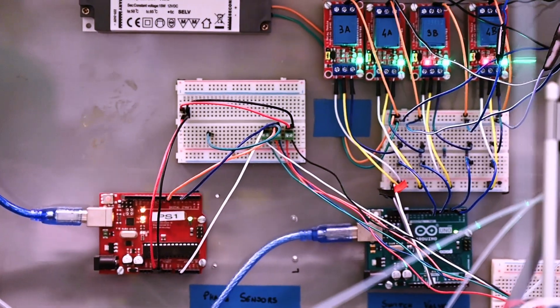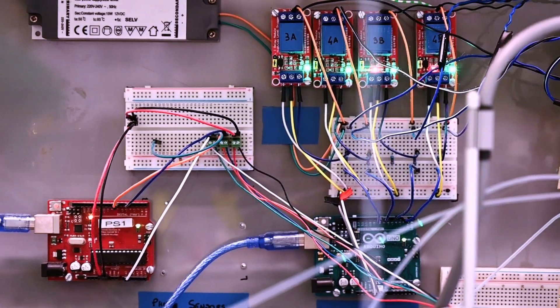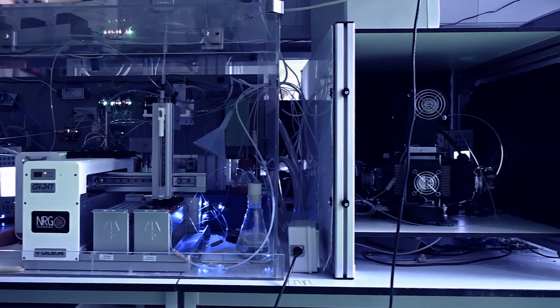RoboChem provides several benefits to classical chemical making. It's much faster, it works 24-7, it has higher precision, and it's also intelligent, finding you the best possible reaction conditions with a minimal amount of waste.